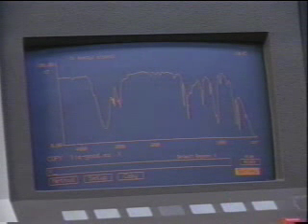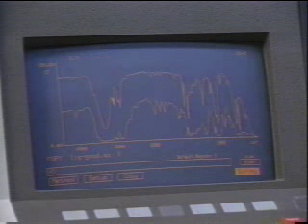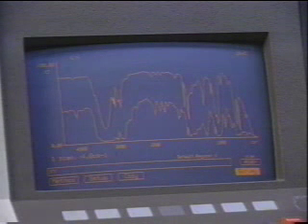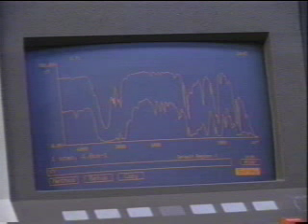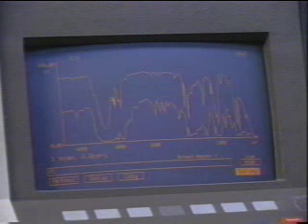Compare this spectrum with benzyl alcohol run on mistreated plates. The pits on the mistreated plates will cause a thin film to be uneven. The radiation going through the sample will scatter, causing the bands to be broad rather than sharp. In the case of fogged plates, fogginess will cut down on the radiation passing through the sample, causing the spectral intensity to be attenuated. So the condition of a salt plate has a dramatic effect on the appearance of the FTIR spectrum.